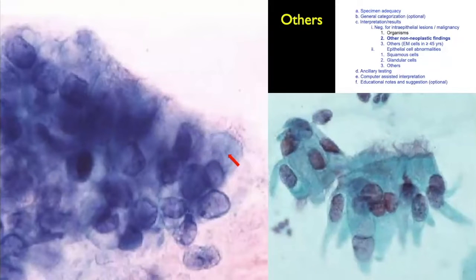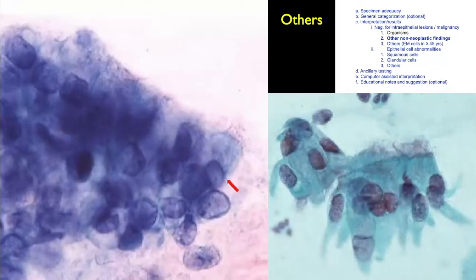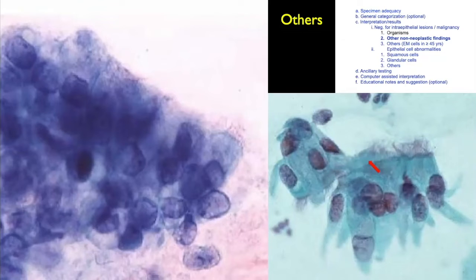Here, if you are very lucky, you can see cilia clearly — tall elongated cells, very easy to diagnose tubal metaplasia. But if you see only a cluster without peripheral cilia, you may mistake it for AIS or adenocarcinoma. So whenever you see clusters of glandular cells, look at the periphery for cilia — when you see cilia, it is benign tubal metaplasia. Tubal metaplasia is easy in histopathology but very difficult in cytology, especially when you do not see cilia or terminal bodies.